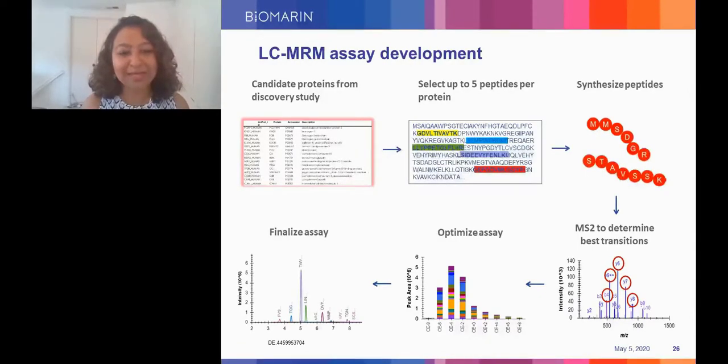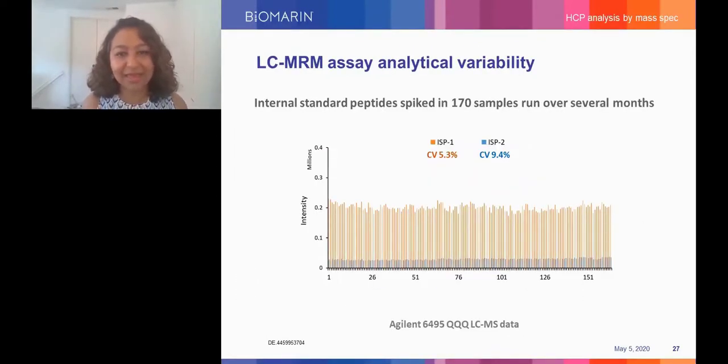After assay optimization, the final assay will have all of these transitions, like you can see in the bottom left, where each peak actually stands for a given peptide and therefore a given protein. And you can have hundreds of these in the modern triple quads that we have. If one worries about the quality of the assay, one can qualify these assays and validate them as well.